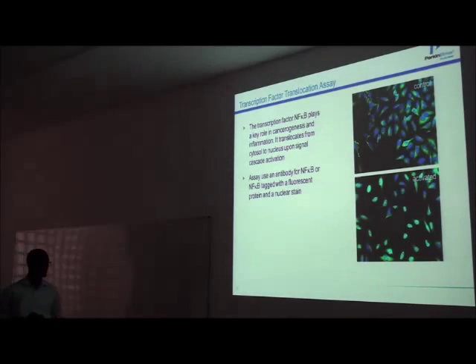So for NF kappa B, that's another example which is very similar to the FKHR, the one I've shown before, translocation. Also after going from this condition to this one, so intensity measurement in different compartments, ratio, nucleus over cytoplasm, very simple. Okay.